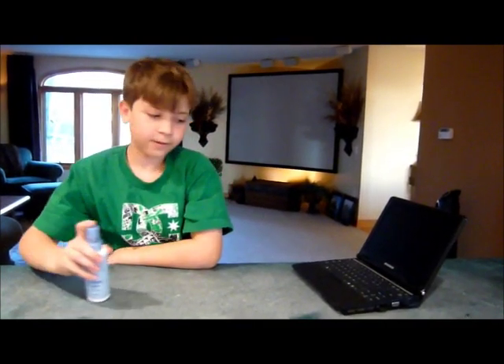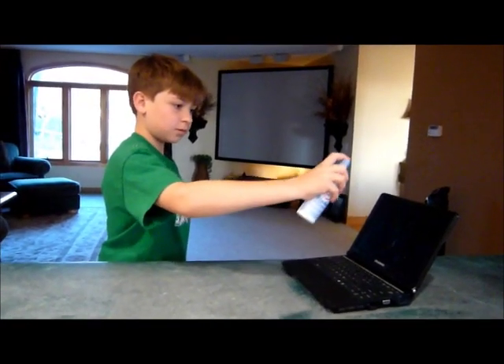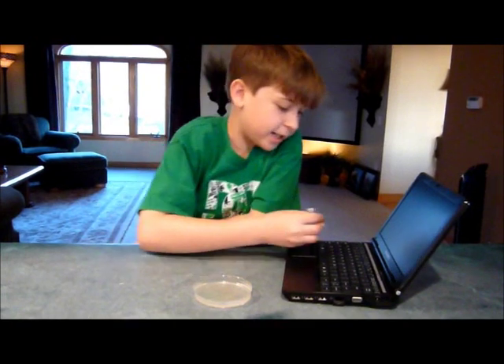Now I'll clean it using Clorox Anywhere Hard Surface Spray. Now let's test it again.